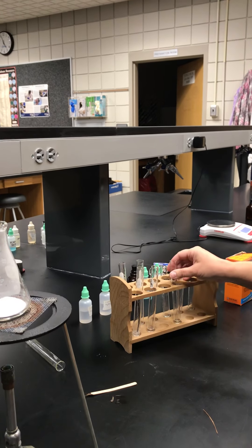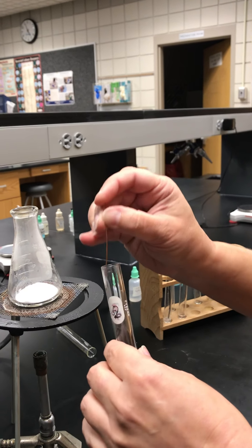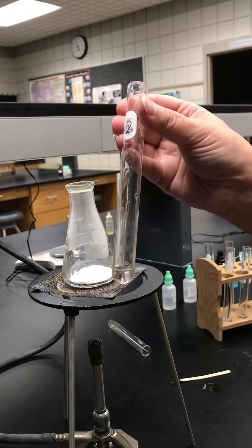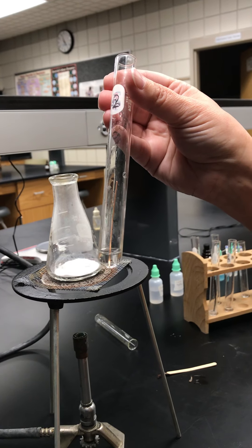For the next part, I have some silver nitrate in a test tube and it wants me to put a piece of copper wire in that. It tells me just to set that aside, so I'm going to put that in there, put it back in my rack, and we'll check in on that in a little bit.